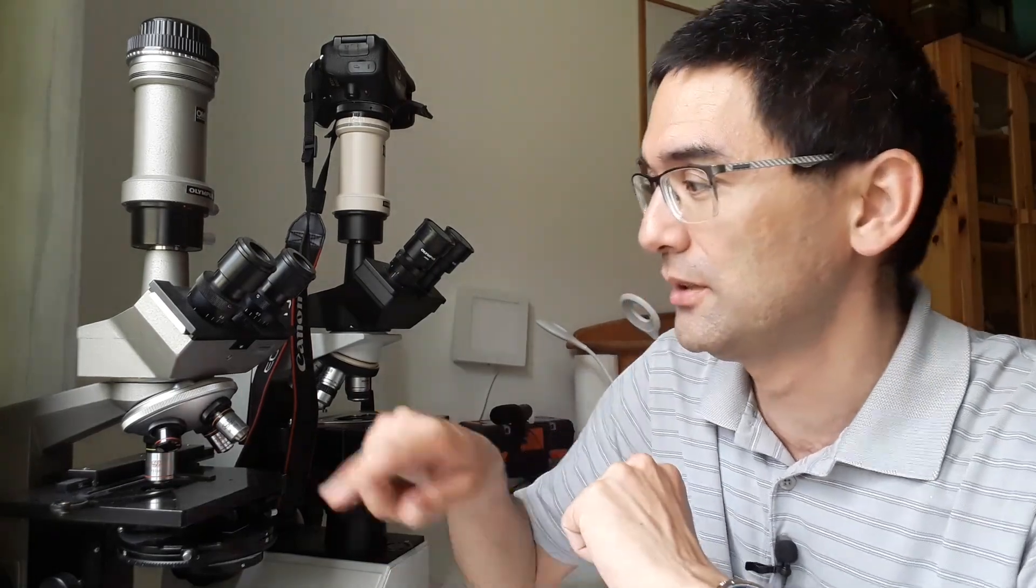Then they want to know if the optics, the objectives that are supplied with a microscope, if they are sufficiently good and I'm going to simply show you now. It's a little bit my intention in this video that actually many different microscope brands use the same optics.